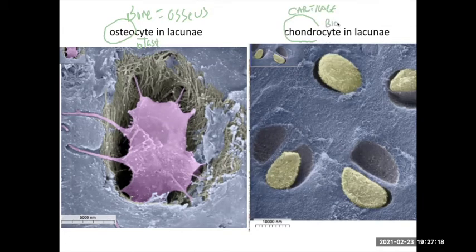Chondrocyte, chondroblast, these are the cells that are within the cartilage. And these two share a closer developmental origin than, say, fibroblasts, although they're all related. They also have a shared characteristic. They're sitting in this little lake, this little lacuna, because the matrix around them isn't very hospitable for this soft, delicate cell. It's sitting in a tiny bit of interstitial fluid in a thing called a lacuna. Those are the other two commonalities.